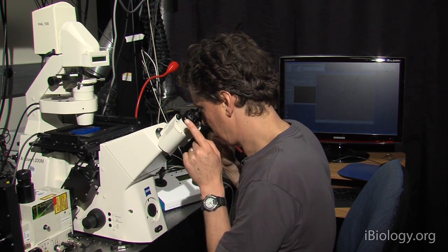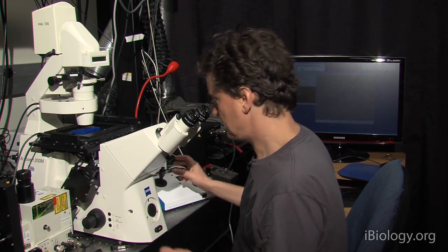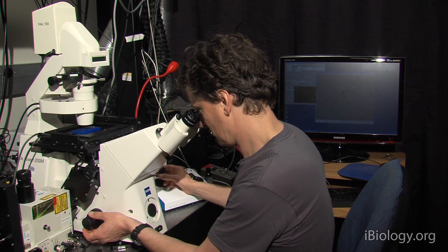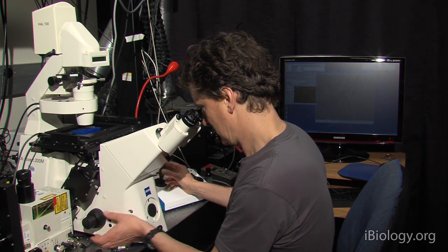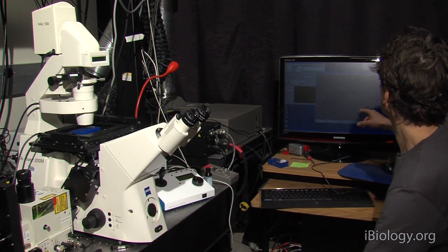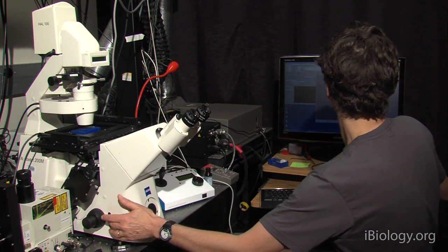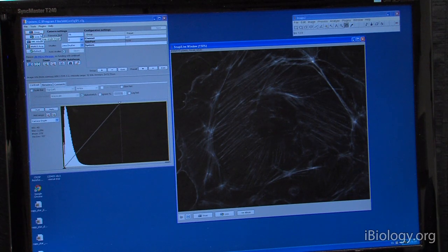And now, I'm parfocal with the camera. So, at this point in time, wherever I go and then focus and now switch to the camera, we should be very close, if not in perfect focus. And that's exactly what we see.